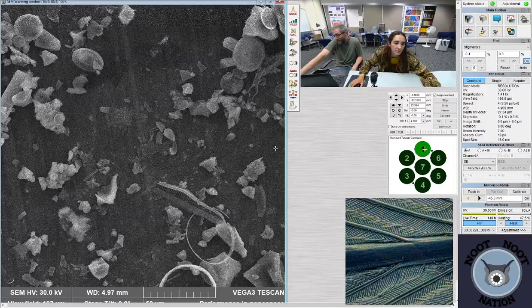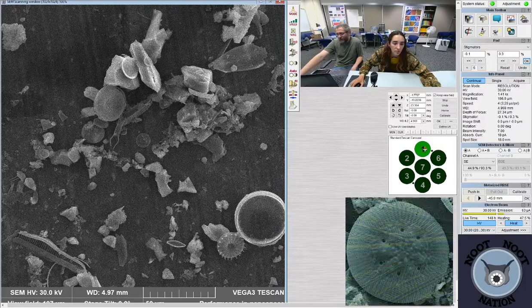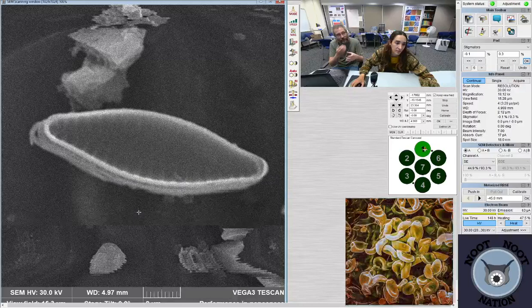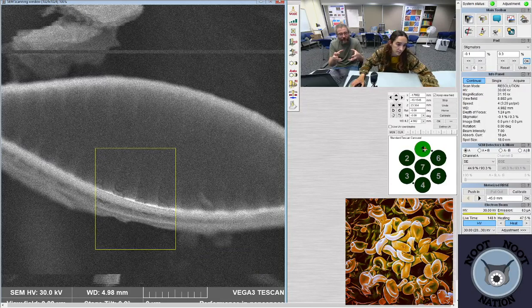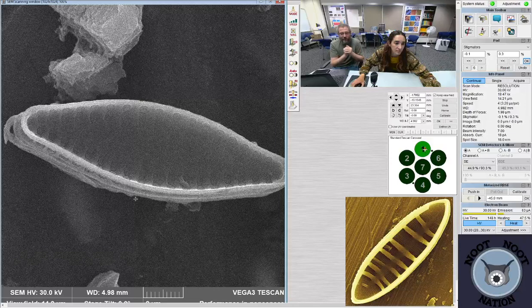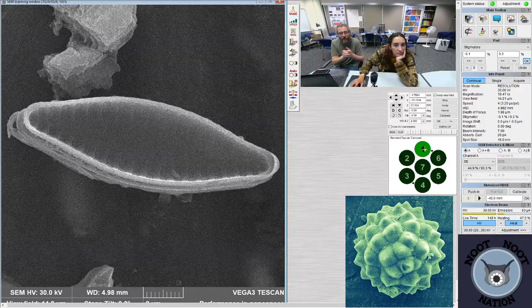Does the tungsten gun use quantum tunneling to release electrons? I don't know what that is. I think what it does is it basically puts a charge through the tungsten and then it heats it up. All of that is contained in the top part called a Wehnelt cap, and the electrons form a cloud around the tungsten up there. Then in the chamber itself, there's an anode with a positive charge that pulls the electrons out. Then there's a series of magnets in the column that force the electrons down through the column to be organized into a tight beam. So in the same way that a lens would focus light, the electrons are focused by the magnets, and that allows us to control where they hit on the samples.